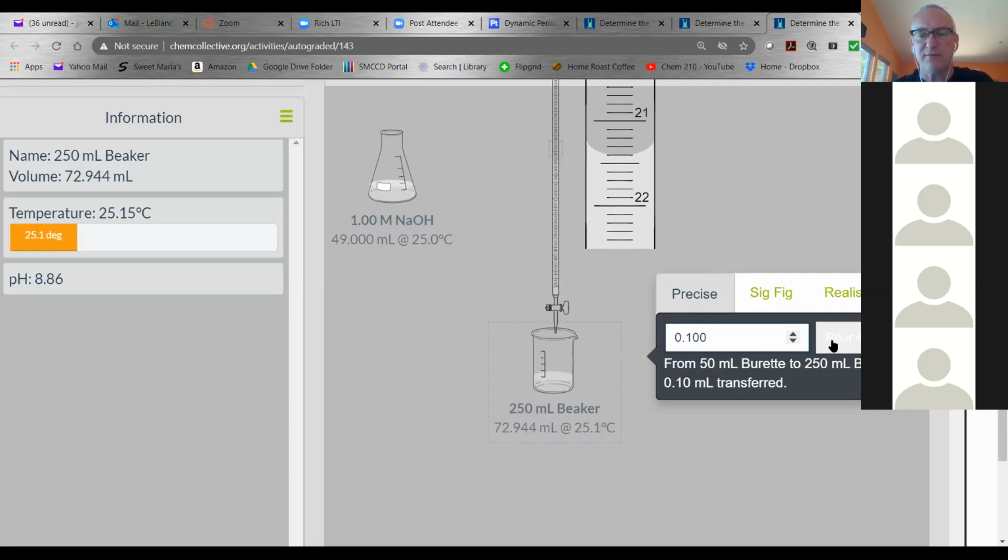Because remember, I'm going to have a different result than you. So my weak acid is going to be... That looks slightly pink. Looks like now it's okay. Yeah, when that went to 9. So it went from 8 to 9. So yeah, what I would do is, I'm not sure, maybe you have better eyes than I do.